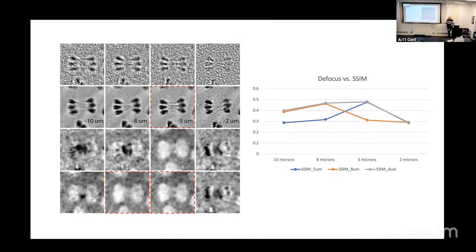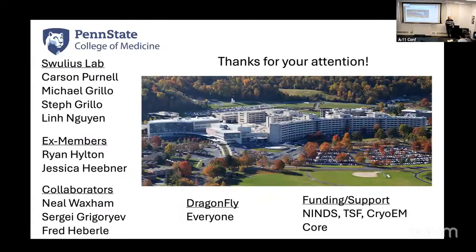So one solution is to train a network that has seen all things. Another solution might be to train a network to see things that are CTF corrected, and then you just correct everything before you send it into your network. But I like this one. Anyways, be careful. That went a lot faster than I thought it would.